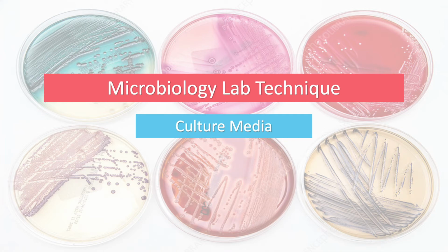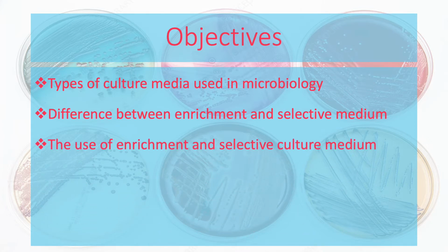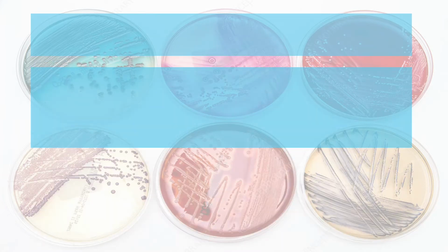Today we're going to look at microbiology lab technique, which is culture media. So objectives for today's discussion are the types of culture media available in microbiology and the difference between enrichment and selective medium. We're also going to look at the usage of both these mediums and the components of these mediums. We're also going to look at some tips for making a good culture medium.